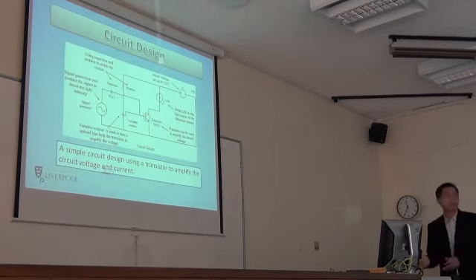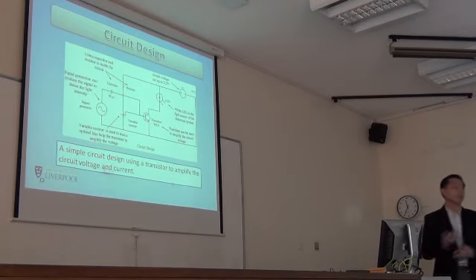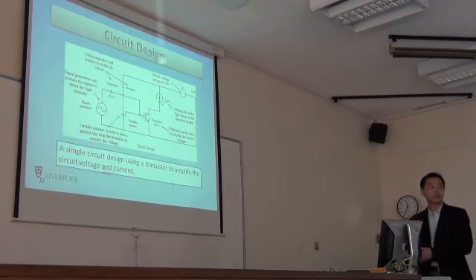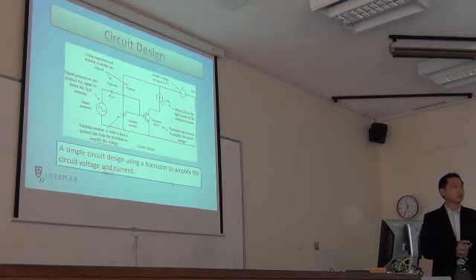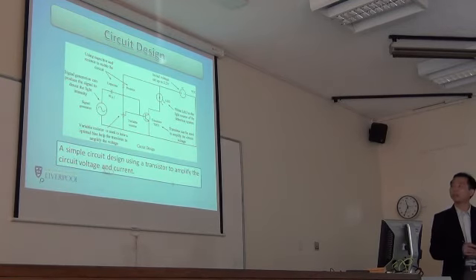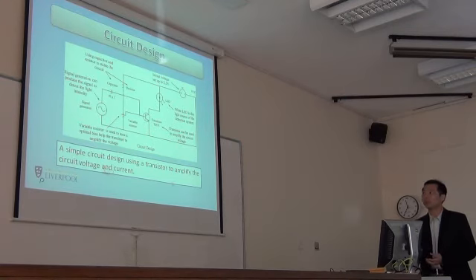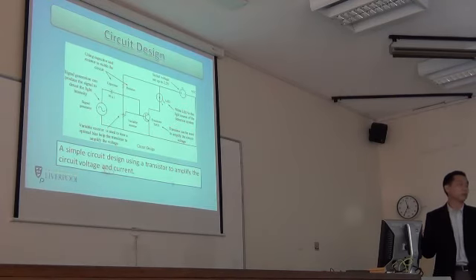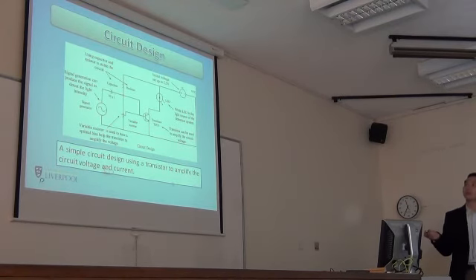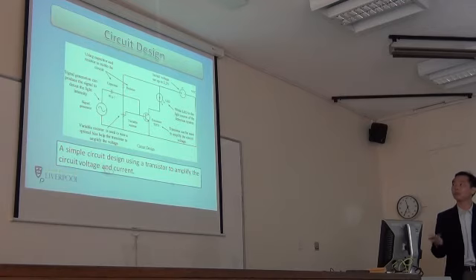So when we have the structure, the first part, we have a light source, of course, and a detector. It's simple because it's just an AC device, and of course the sample. And for the light source, we need a circuit design to trigger the LED. Here, the LED, I don't want to waste time explaining it. I think all of you know it well. I use a white LED, 3 millimeter.